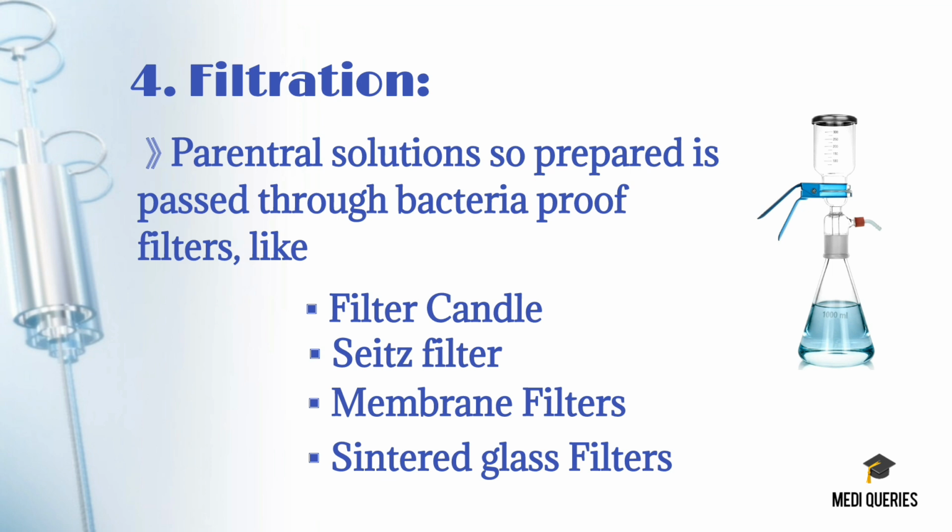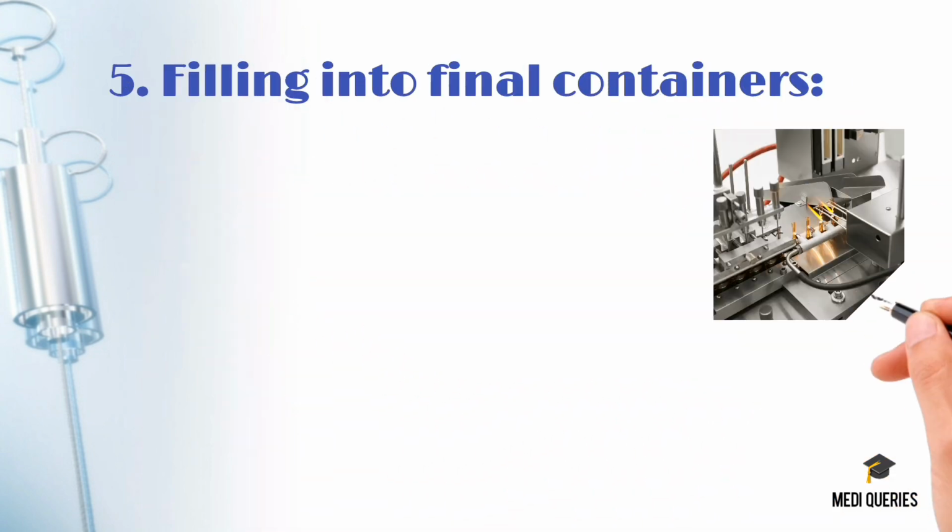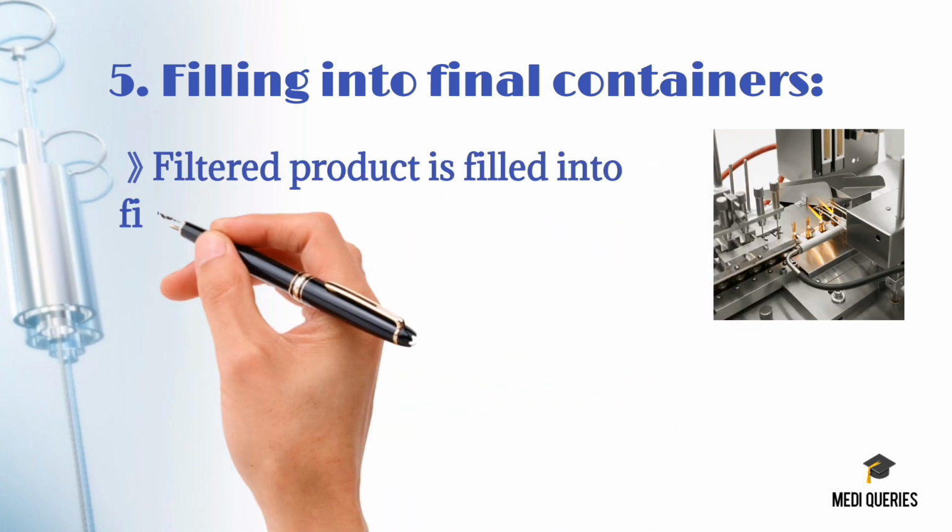If the parenteral preparations are required to be sterilized by means of bacteria-proof filters, filtration should be done under strict aseptic conditions to avoid contamination of the filtered solutions before it is finally transferred into the final container and sealed. After that, filling the preparation into the final container is the next step.